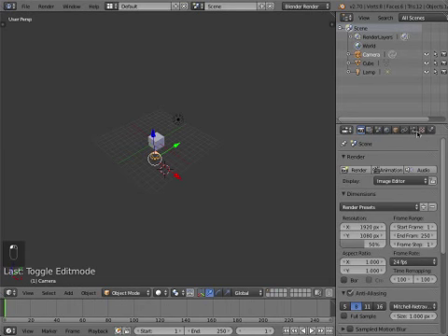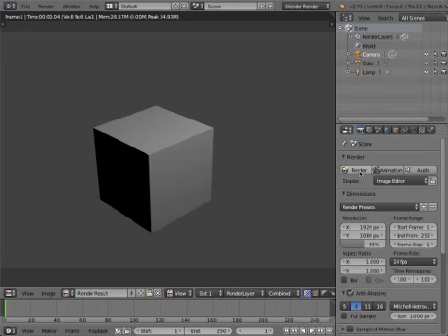And everything where you're doing something, or everything that's associated with objects or with whatever your data is here. So the most basic one would just be, the first thing, just click on render. And if you click on render on your standard scene, you should see exactly that default cube rendered out.